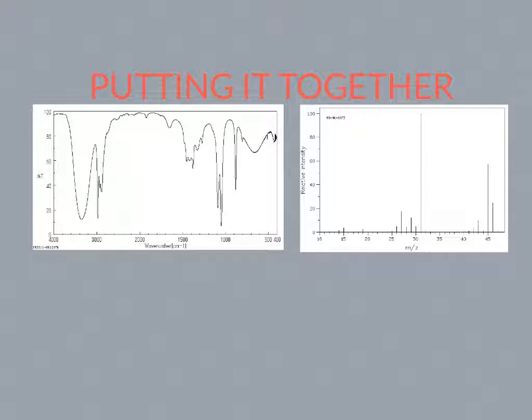So it's looking like we have a formula of C2H6O. When we do the degree of unsaturation for that, and we plug it into our formula, as mentioned earlier, we get a DOU of 0, which tells us we have an alkane with 0 pi bonds. So no double bonds and no triple bonds. From there on, we can go and identify the possible structures.